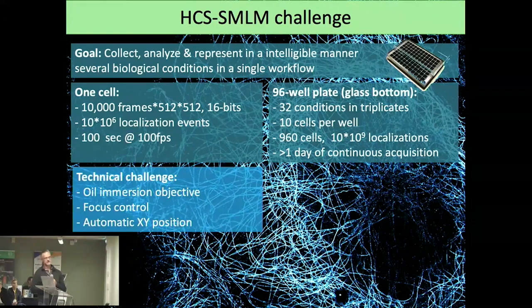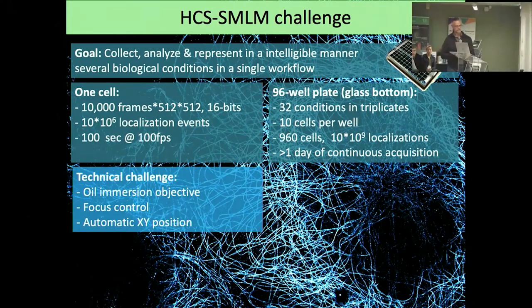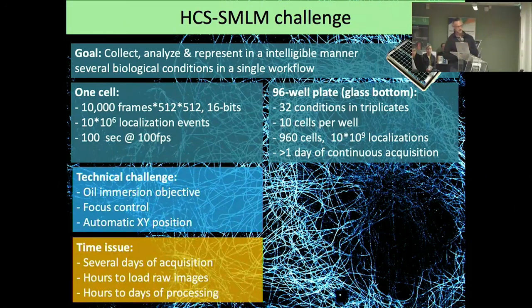And of course, it raises several technical challenges. How do we keep the system stable for that long, with the fluorophore also in the same condition, with the same photophysical properties, because we know this is an important point for quantification. So you need to stay in focus, be precise in many respects, and of course you need software that does not crash, otherwise you will never reach the end. Of course, time is a problem.